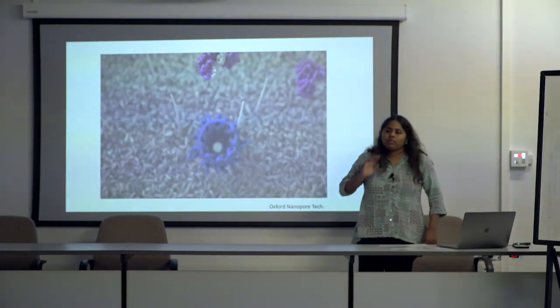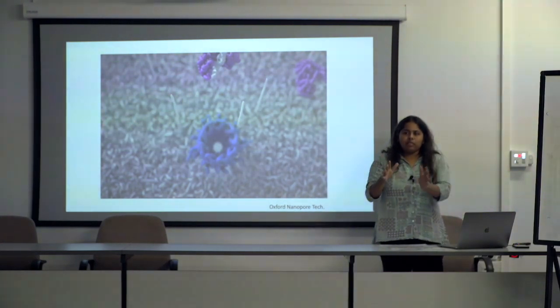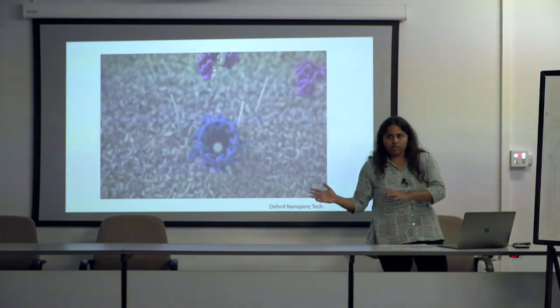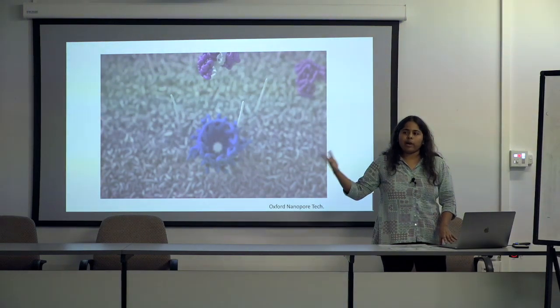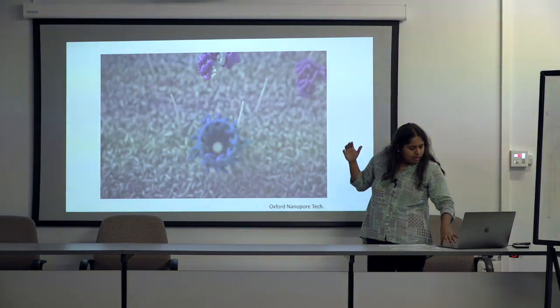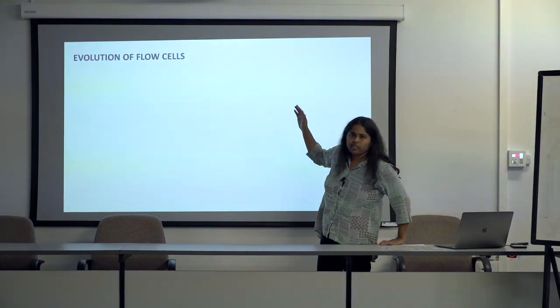And for that, what ONT provides is a bunch of tools, and we don't deal with the conversion of the raw signals to the data set. That's the basecalling process. And what has been happening with ONT is it has been changing and evolving quite rapidly. So I would say that there are three main things that have been changing in ONT.